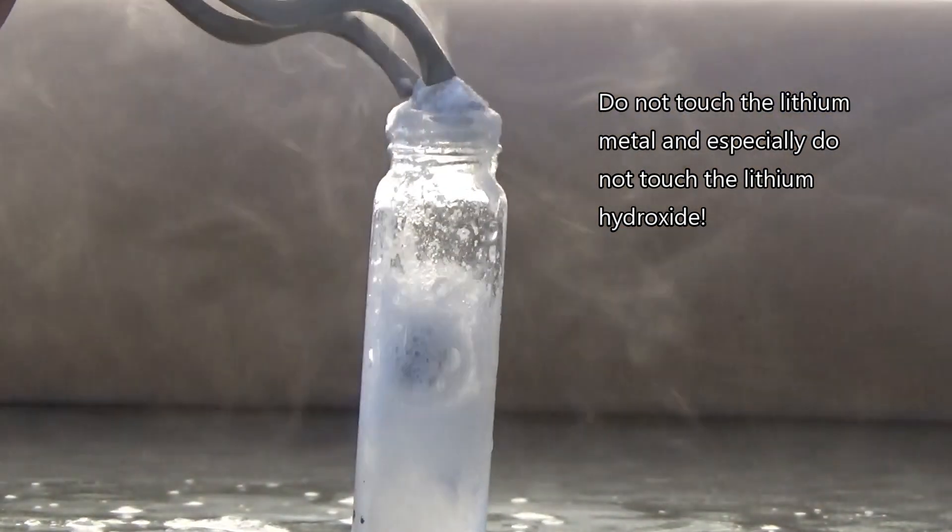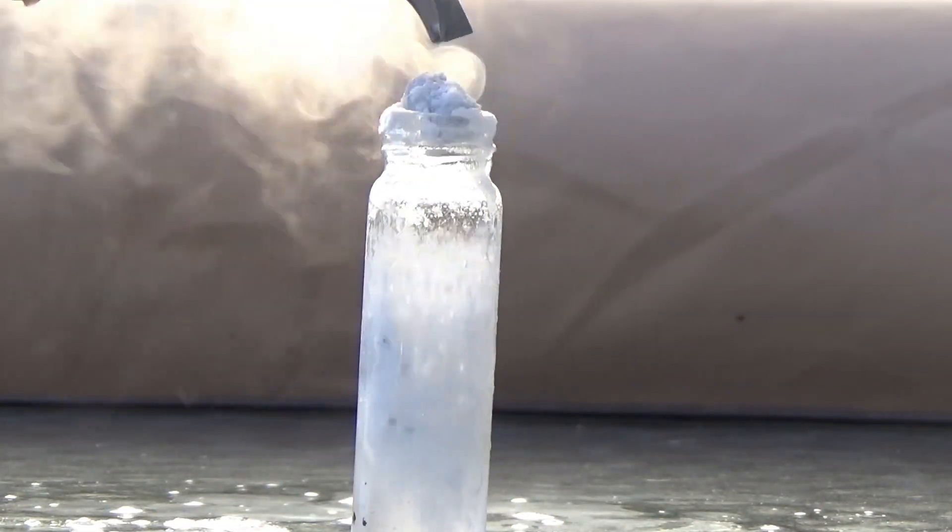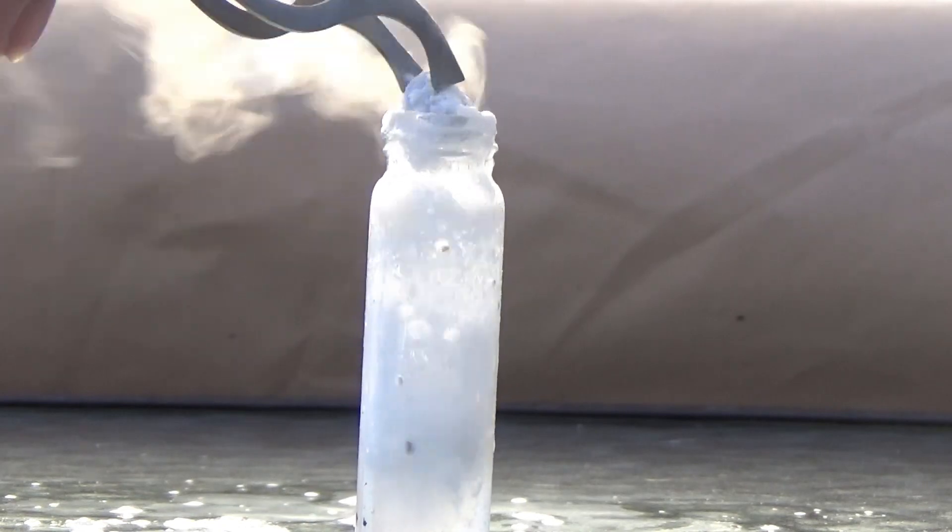Alkali metals are dangerous. This experiment is done outside to avoid the nasty fumes that come from it. Please do not try this at home. So let's get started.